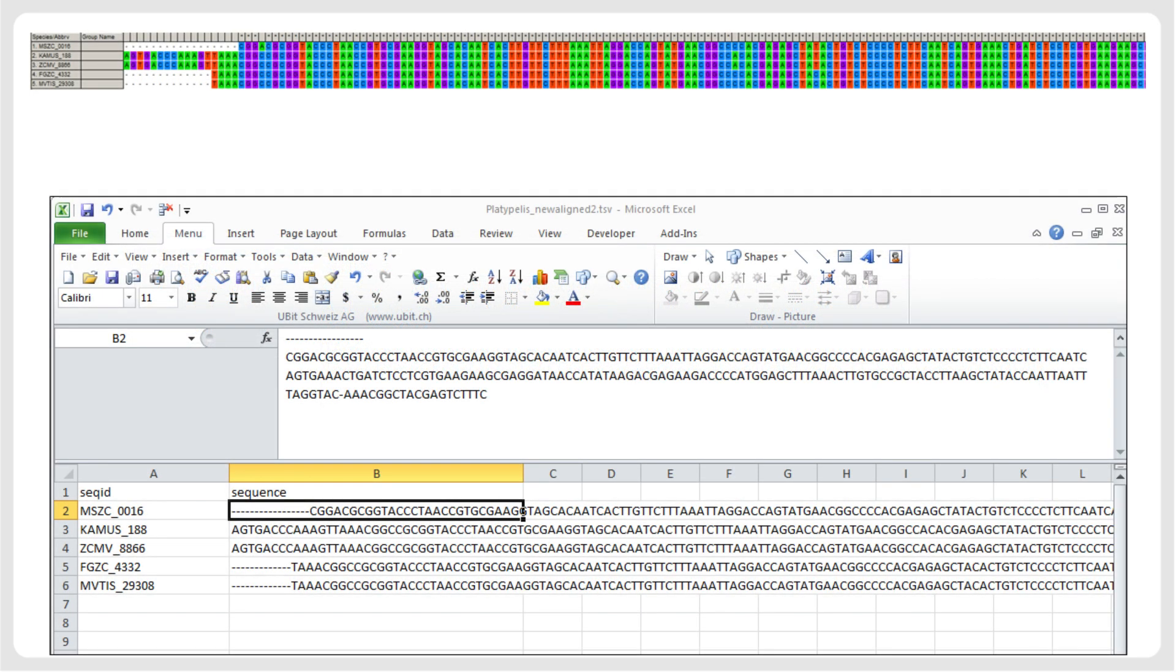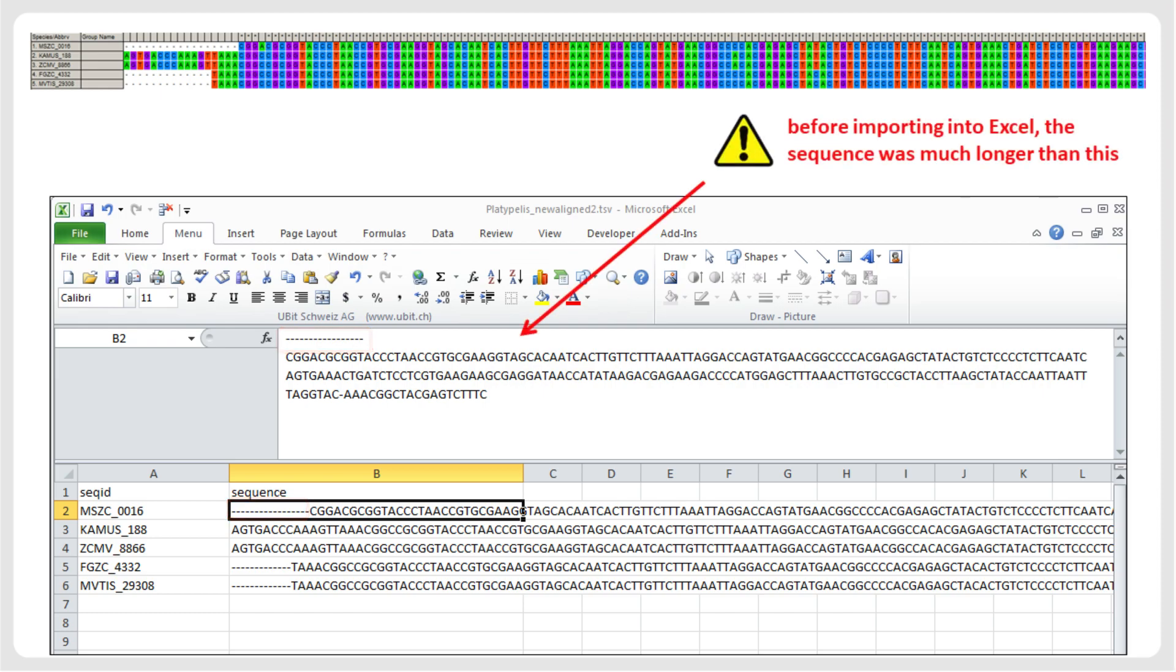When curating sequences in spreadsheet editors, an important caveat regards aligned sequences. So far, we have shown how to include unaligned sequences in text format into a spreadsheet. However, there may be use cases where you want to work with aligned sequences. In alignments, missing data and deletions are usually indicated by a dash character, and often there is missing data at the beginning of some of the sequences. When pasting or importing such sequences into spreadsheet editors, the first dash of a sequence might be interpreted as a minus, and consequently, the sequence will not be correctly imported.